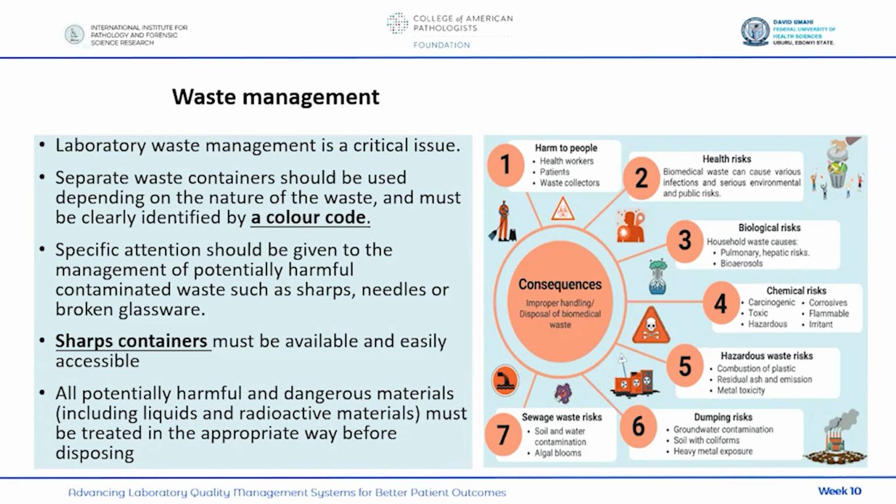So let's go back to waste management. This also is a critical issue, the lab waste management. And I know that we are familiar with color coding in the laboratories. So it is expected that we dispose of waste using the color code, and special attention is given to potentially harmful contaminated waste like sharps, needles, or broken glassware.